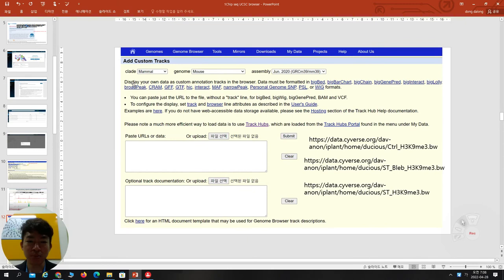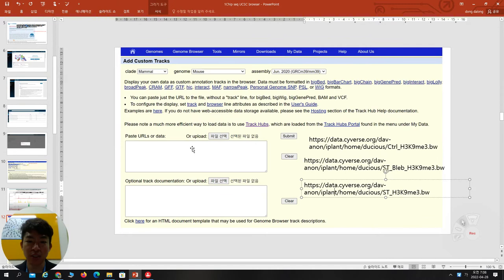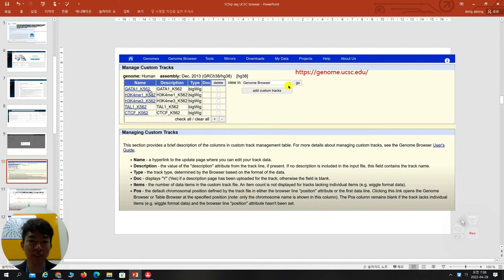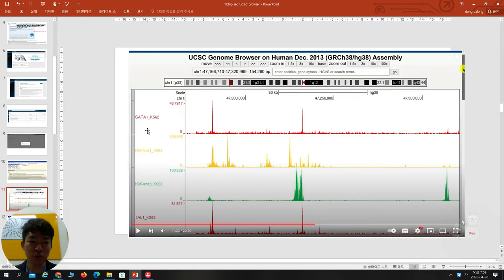So how do you copy and paste? Here, this is your custom track box — you copy and paste those file URLs in here, then submit. If you have only one file, you paste one URL. But if you have several groups — maybe three, four, or ten — you can copy and paste them into different rows, then submit, and they will display like this. These five files are from different datasets, so from five different BigWig files, I can show one, two, three, four, five tracks.